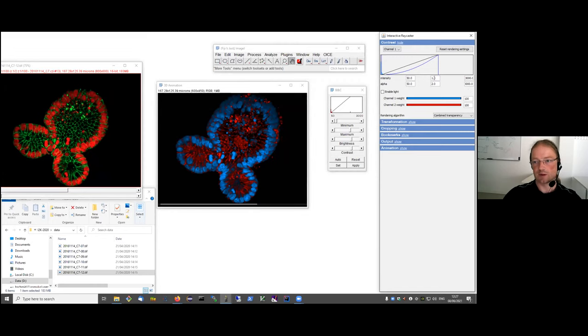In 3Dscript, we have an additional parameter, which is called a gamma parameter, which lets me highlight or suppress the midtones. So I can just scroll in here to highlight values in the middle range. And then we have an additional set of three numbers here for alpha, which is basically opacity. The minimum specifies when a pixel is fully transparent, the maximum specifies when a pixel is fully opaque. And also here we have a gamma value. And as I said, this is per channel.